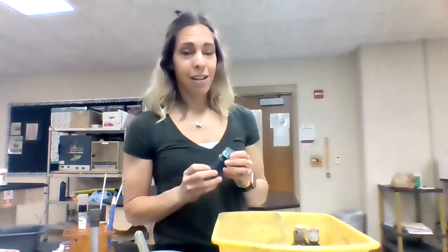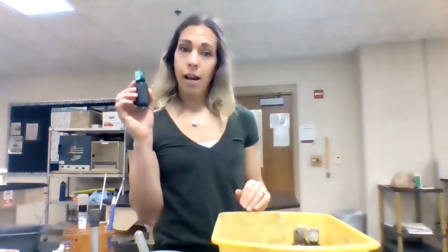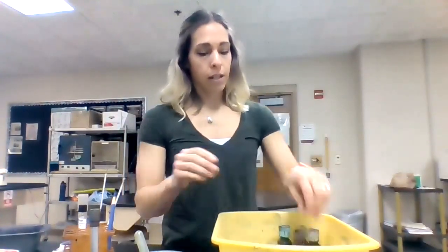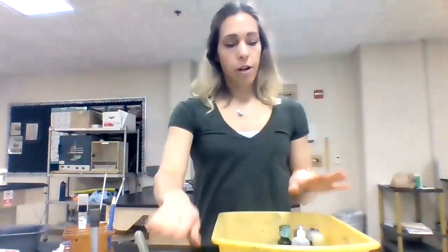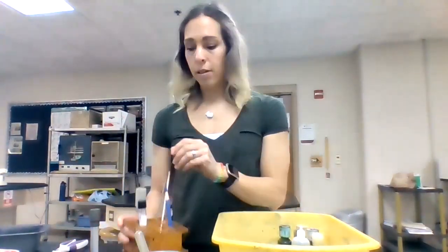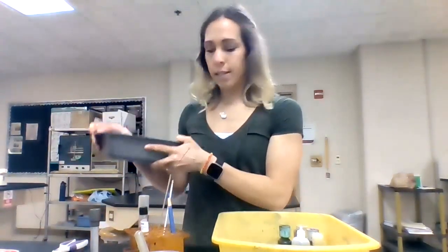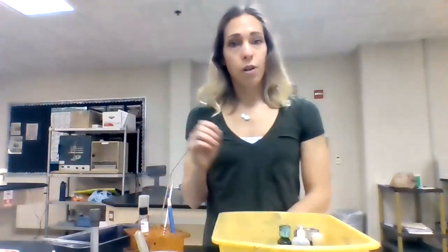So you should have your crystal violet, your iodine, your safranin, and your malachite green, your alcohol, your water cup, your clothespin, your soap dish, test tube rack with a loop and a stab, wax pencil, bread pan with a slide holder, and you are all set to go.